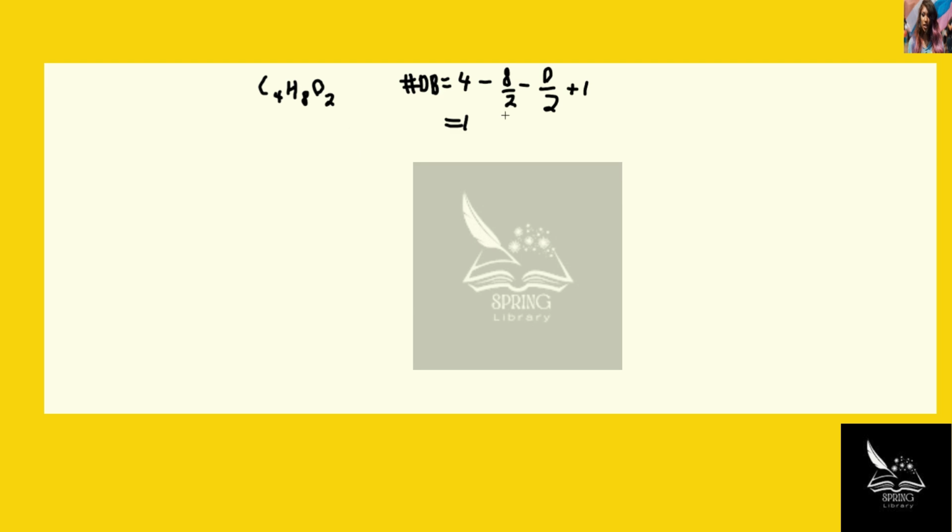And if we look at the H NMR data, we see that we have 1 proton that's going to be a singlet, so it's not neighboring anything that can couple or split the signal at 11.8. So right off the bat, we can say that the only way that we can have a proton that is not neighboring any other protons is if it is on this oxygen that is next to a carbonyl group. So essentially what we have is a carboxylic acid.